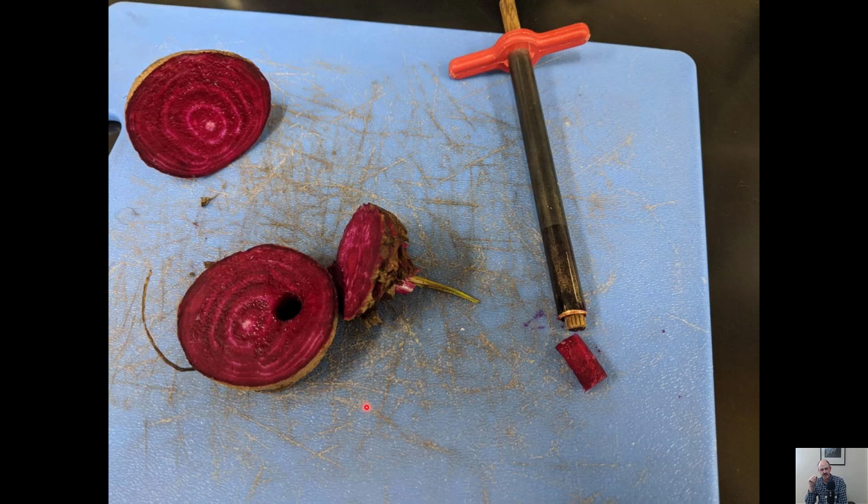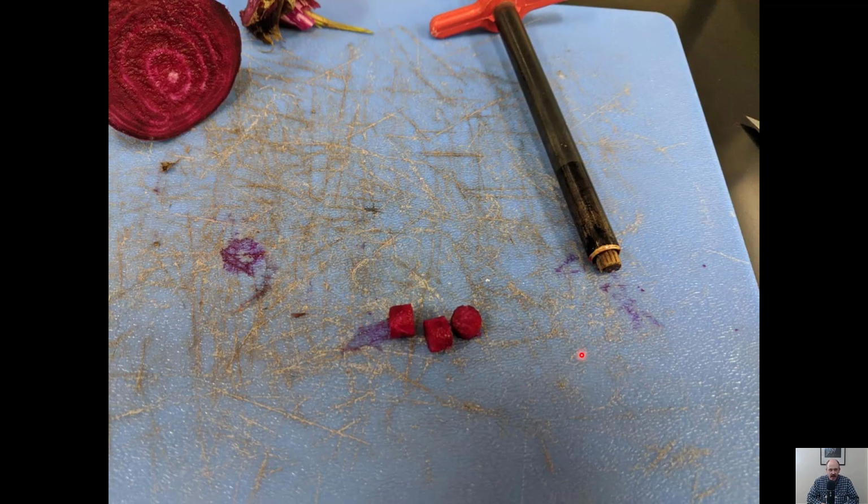So what you do first, just so you understand what's going on, you're going to make these different concentrations of ethyl alcohol, and you're going to put them into a test tube. Your lab manual or your instructor will tell you how much to put into each test tube. Then you're going to take a cork borer, which is this thing right here, and you're going to stab it into a beet, and that's going to make a core like this. And you're going to carefully cut that into 5mm thick discs like we see here. And you're going to do that for all of your test tubes.